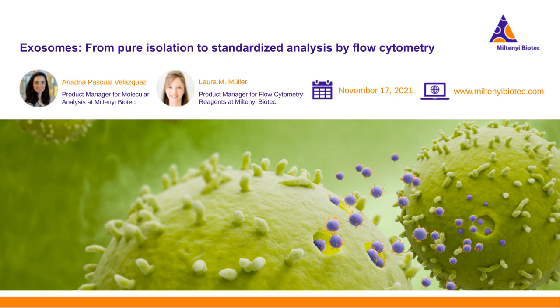And of course, as we are using one dye in the standard assay, we always detect two markers on the same vesicle. However, it's of course possible, if you're using a flow cytometer, to use additional dyes, additional colors, as another antibody, and thereby you can get more information about additional markers. But for each marker, you always get the information of the two markers present on the same vesicle.